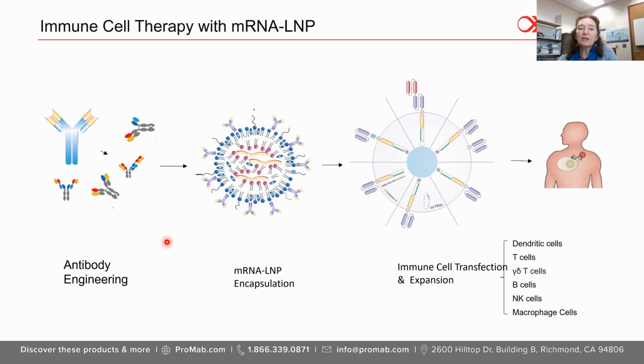No, these would be secreted antibodies, for example, with Fc. You encapsulate them in nanoparticles, and then you transfect cells, for example 293 cells, and they will secrete these proteins. You can purify these proteins and use them in your functional analysis. So it's very convenient for research, and in future we are planning to do it as production in vivo. Yeah. Oh, okay, I see. Okay, it's a very smart strategy.